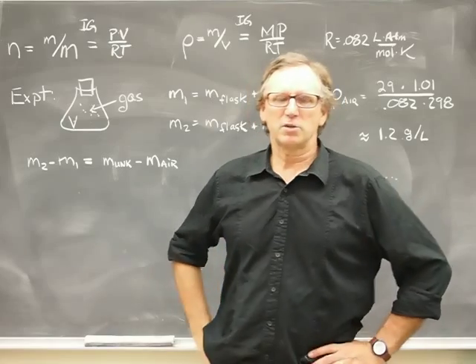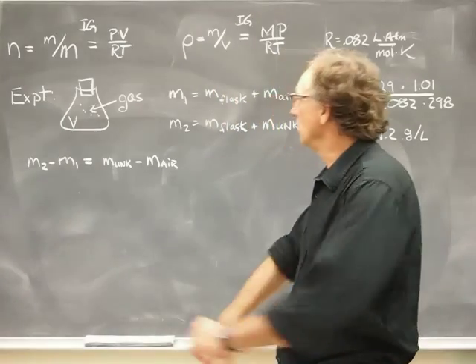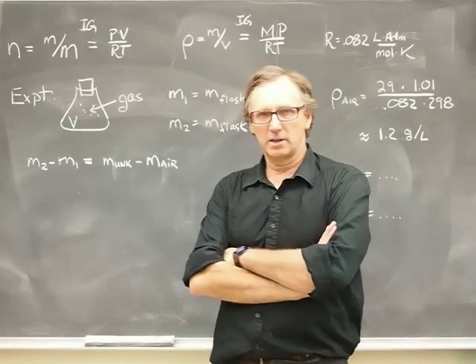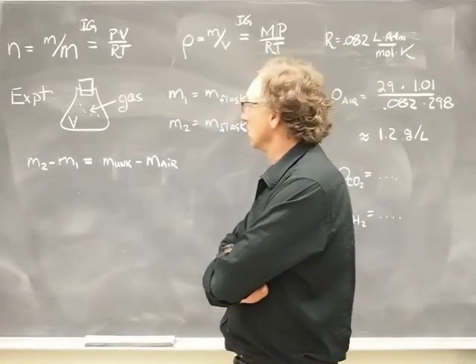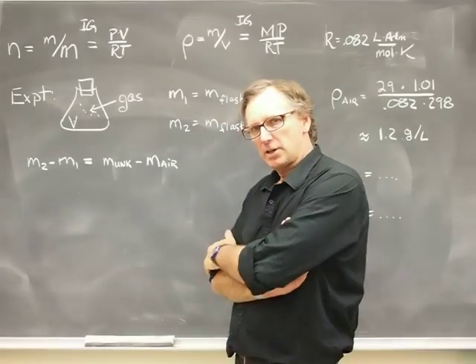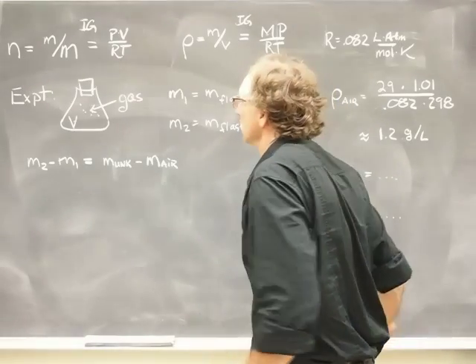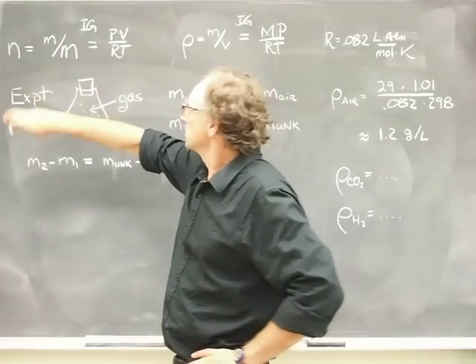Hi, I'm Stephen Neshiba, and I'm here to help you identify some unknowns in a gas lab based on densities of the unknown gas. So I'm just going to take you through a few equations and some bit of strategy here. So here's some key equations.